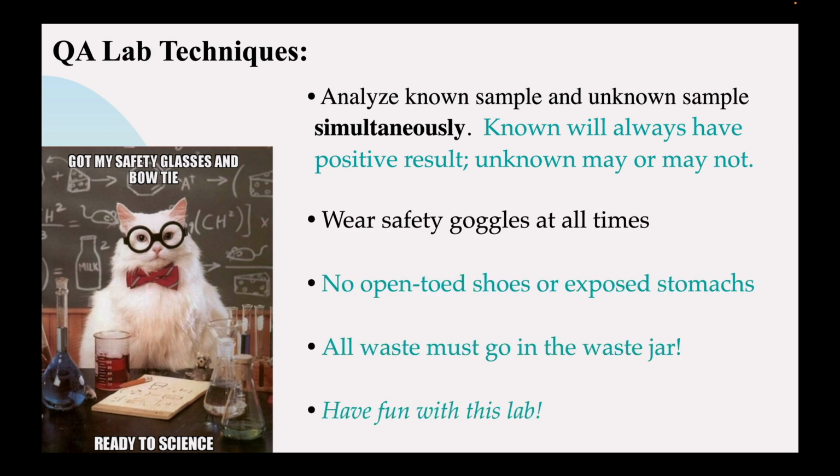Safety goggles, super important. Don't even think about taking them off during this lab. We have so many chemicals running around, it gets kind of crazy, so make sure you have them. Again, your safety is really important, so I do not want you to wear open-toed shoes like sandals and Tevas. If you wear a shirt that exposes your stomach, I won't be happy about that either, so just be really careful. All right, don't wear shorts.